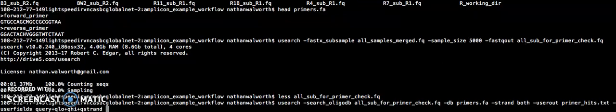So what does this command mean? So this command is searching for the primers in that subset of sequences and generating an output file called primer_hits.txt, which will contain the results. We denoted in the last argument that the file will have 4 columns per line: the sequence ID, which is the query, the start position of where a primer aligned, which we denote as Q low, the final position of where the primer hits, Q high, and then if it's on the plus or minus strand for whether the primer was in the same orientation or if it's the reverse complement that was matched.